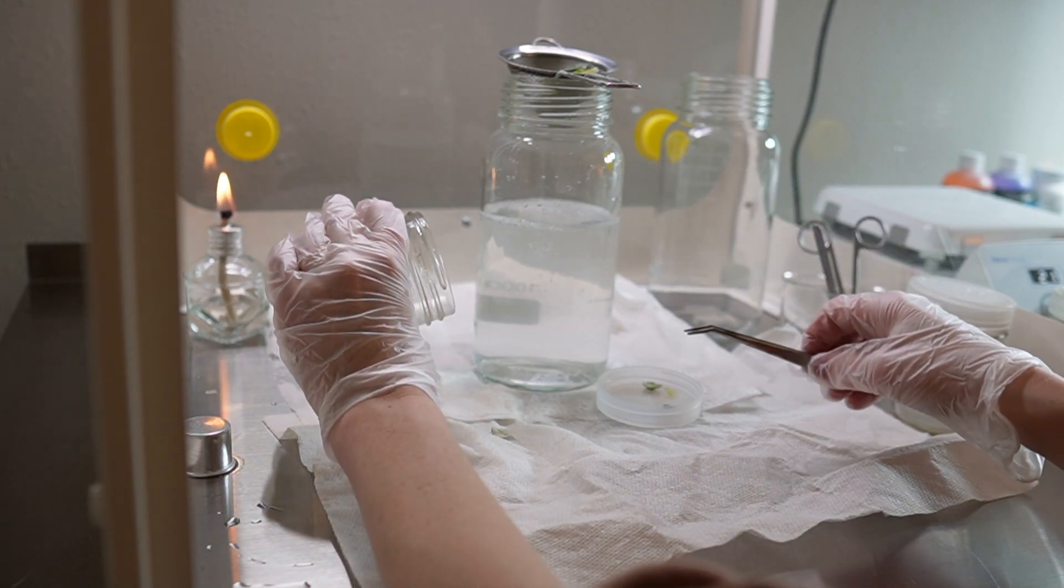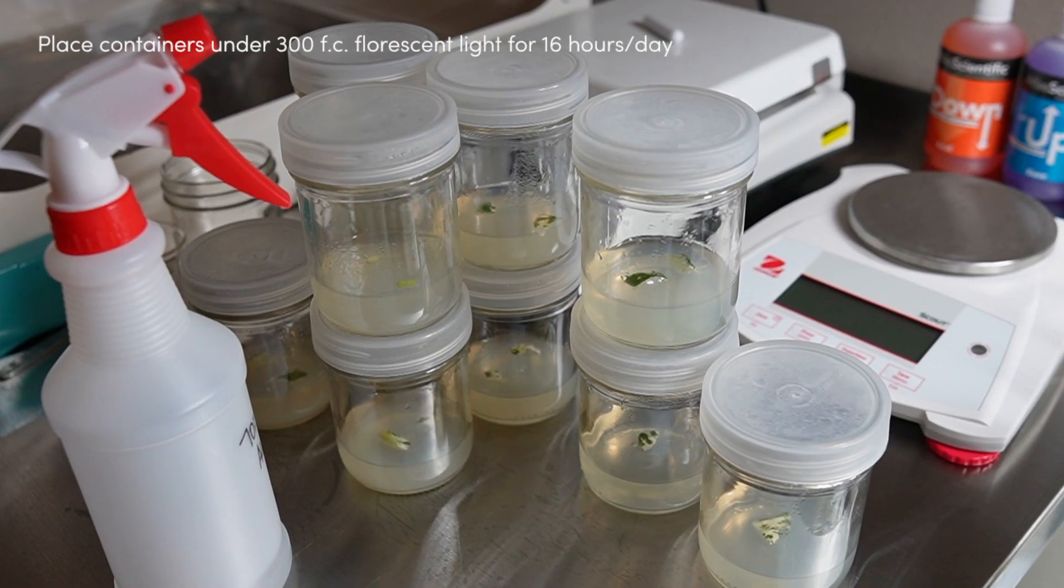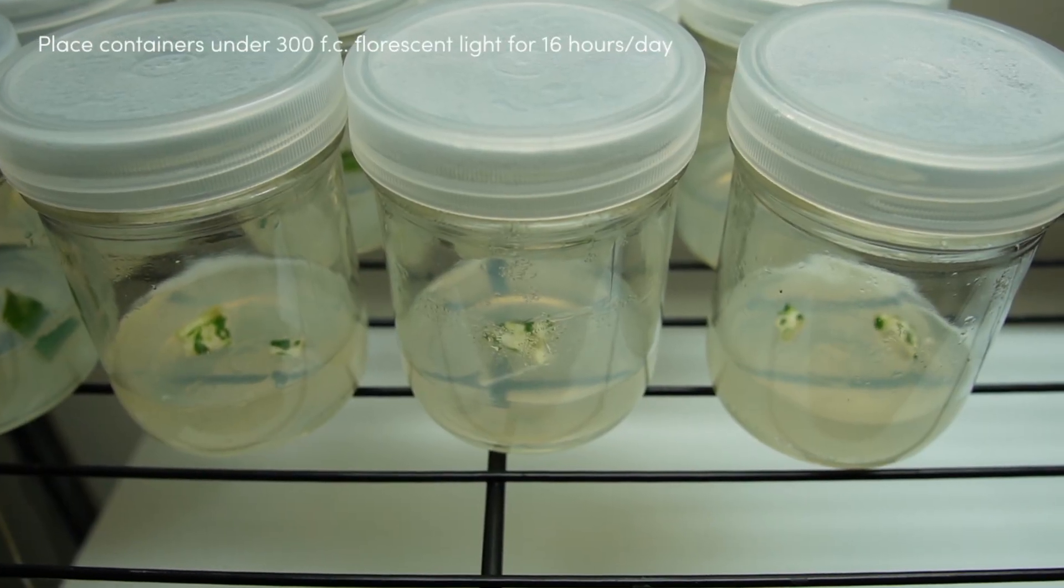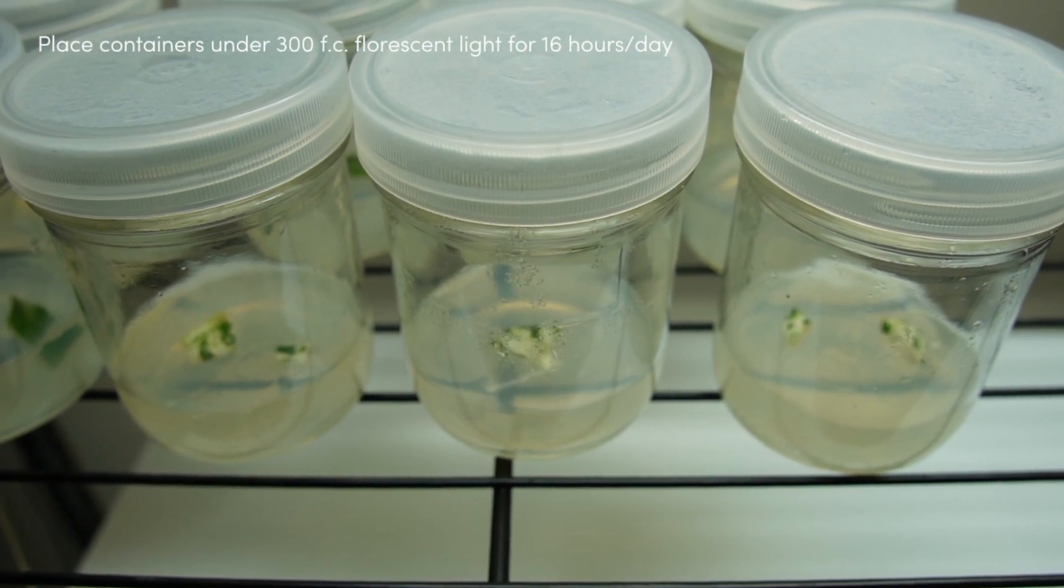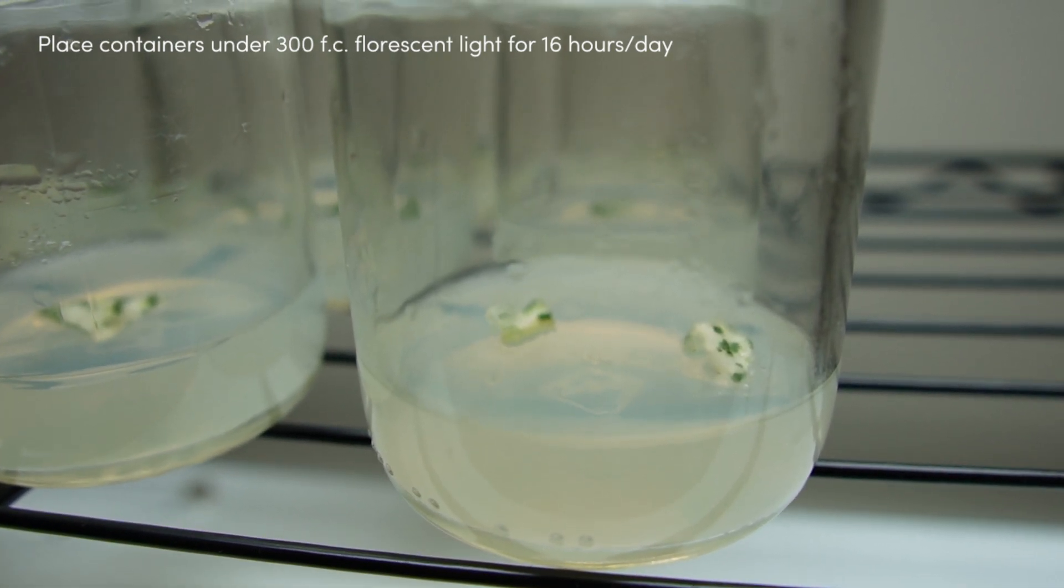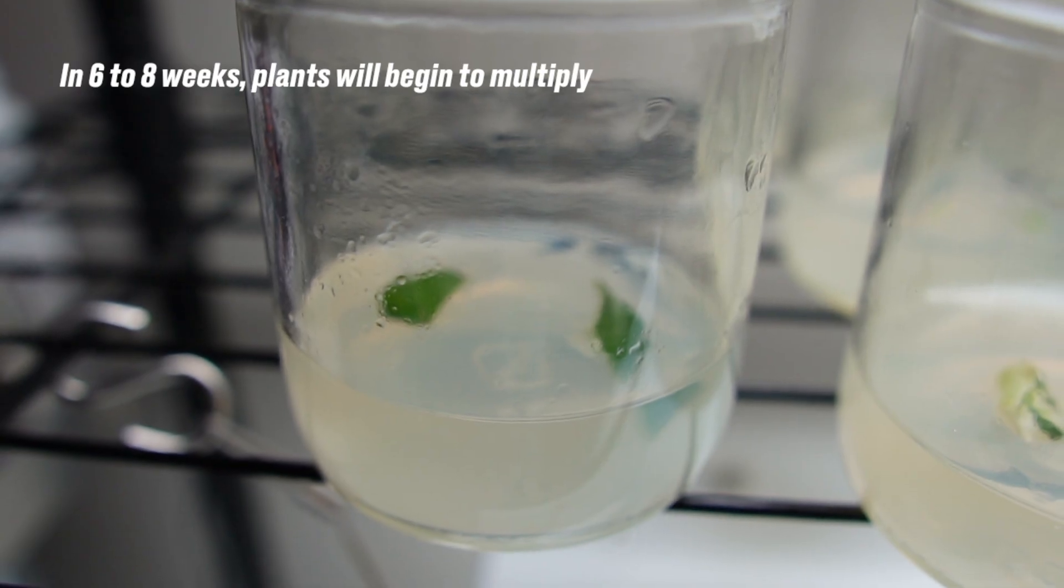And then once I've collected all my jars of explants, I didn't show them all—it would have been boring to watch. But I place them under a fluorescent light, about 3000 lumens or 300 foot candles. That's about the same. And I leave them under there for 16 hours a day, and then in six to eight weeks we should see the beginnings of some multiplication.